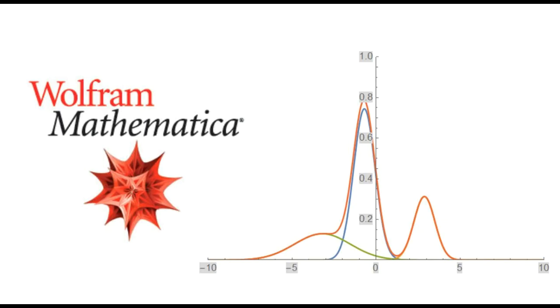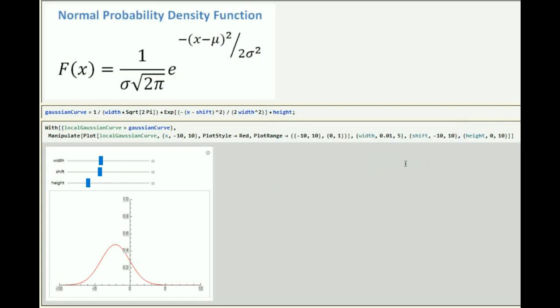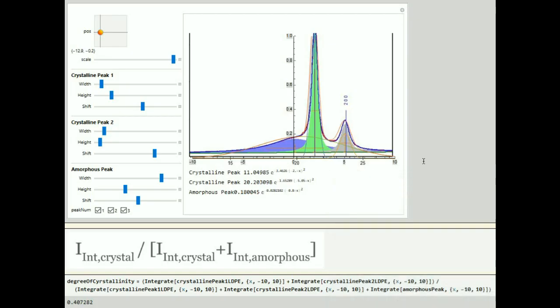I set out to create a peak fitting software to calculate degree of crystallinity for semi-crystalline polymers using Mathematica. The basic idea for this program is that the user will define a series of Gaussian peaks using this equation. The width, the height, and the exposition of these peaks can be manipulated. This code allows the user to adjust the appearance and position of multiple peaks and match it to an existing XRD pattern.